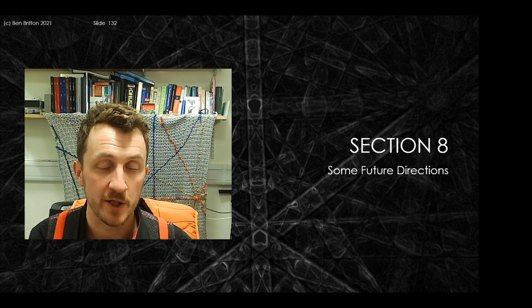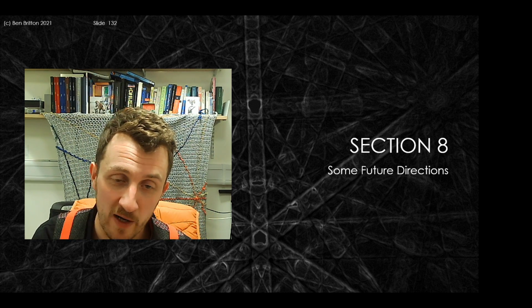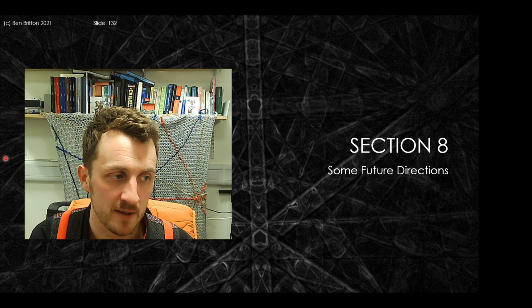This is the final section of the Introduction to Electron Backscatter Diffraction lecture. So in this I'm going to show you, hopefully it's a bit more light than the rest, but this gives some future directions and possibilities and potential for EBSD type analysis.